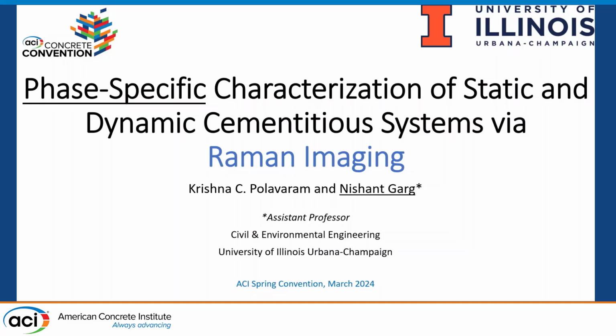But this basically summarizes the work he did over the past 4.5 years, developing Raman imaging for cementitious systems, right? And I underline the word here, phase specific. What I mean by that, I'm going to explain as we go. And let's go through that.